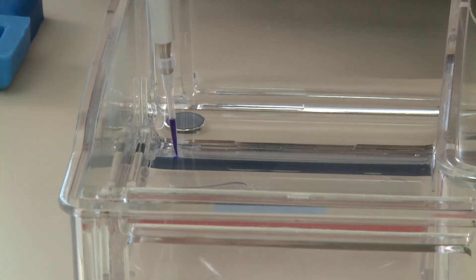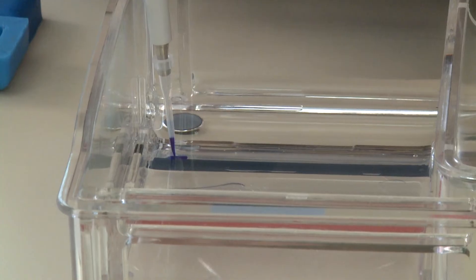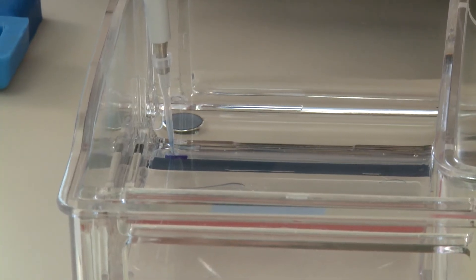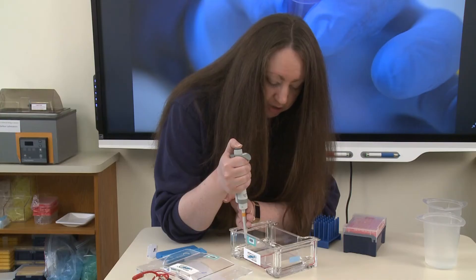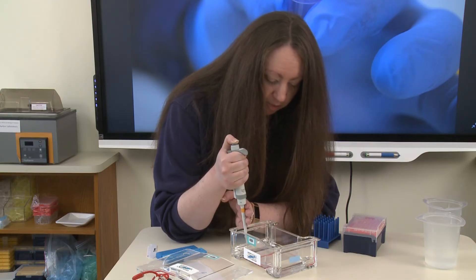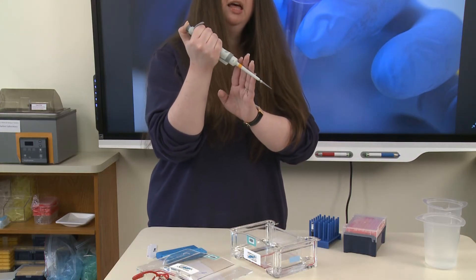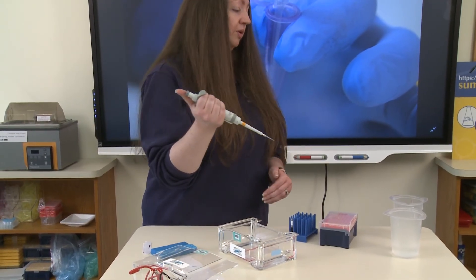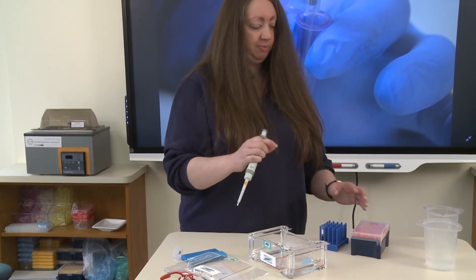To load my sample, I'm going to slowly press down on that plunger until I reach the first stop. Normally when we're pipetting a sample, we pipette to the second stop to release all of the solution. This is the only time that we don't do that, because pressing to the second stop would push an air bubble into our well and push the sample up and out. So I'm pressed to the first stop and I have my sample loaded. Now I'm going to keep my thumb pressed down, pull my pipette tip up and out of the well, then remove my thumb from the plunger. I'm finished with this pipette tip, so I'm going to dispose of it and get a fresh one to avoid cross-contamination.